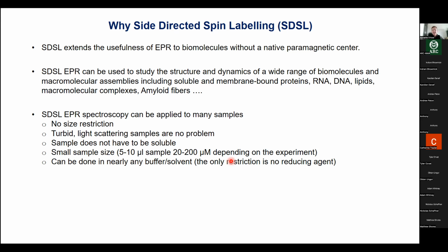The sample size is relatively small, as I already said, and it can be done in nearly any buffer and solvent, with the one exception, no reducing agents, because they would reduce your free electron and you would lose your signal.